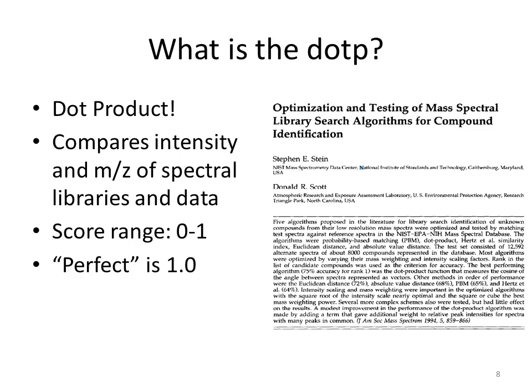I've done this experiment where I've generated product ion spectra like this on like 5 different linear ion traps back when LCQs were like the big thing. And the reproducibility of their ratio in a single spectrum, the biggest is always the biggest, the smallest is always the smallest, and whatever's in between is in between, that is like within 5%, even on different instruments, because that dissociation process is so reproducible.